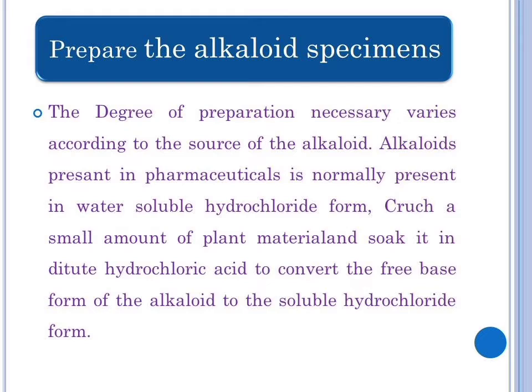Prepare the questioned alkaloid specimens. In this procedure, we prepare specimens of various substances that may contain alkaloids and test them using Dragendorff's reagent for the presence of alkaloids. Dragendorff reagent is non-selective in the sense that nearly any alkaloid yields a positive test, a bright orange suspension that settles as a bright red-orange precipitate. Dragendorff reagent is quite sensitive.